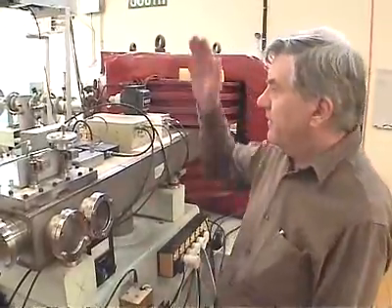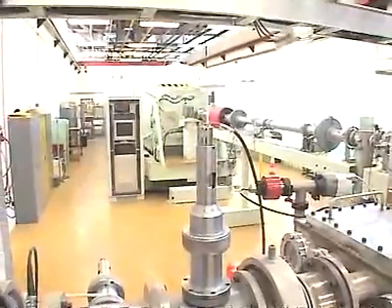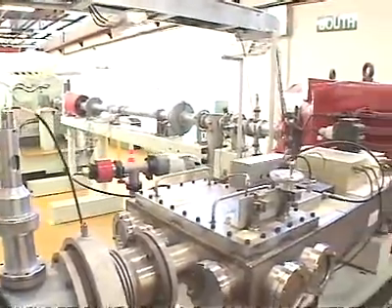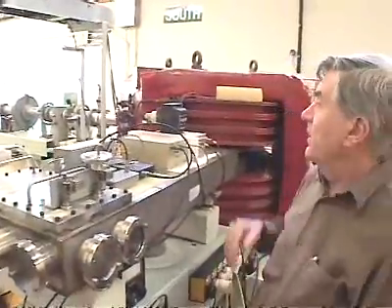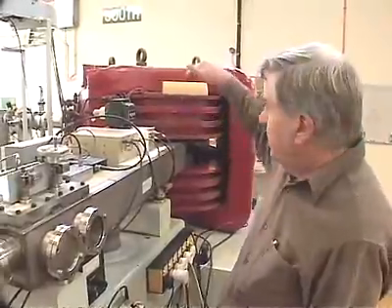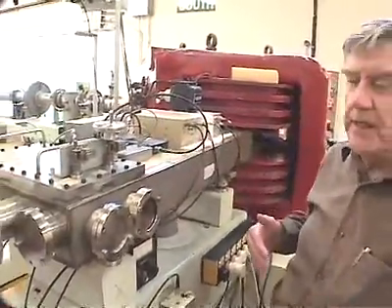Well, here we are at the main magnet after the accelerator. Our carbon atoms are coming from the accelerator, which is in that large green tank down there, and they're travelling down the grey tube at something like 6% of the speed of light. When they come into the magnet, their path gets bent. So instead of travelling in a straight line, they get bent through 90 degrees and travel towards us here.